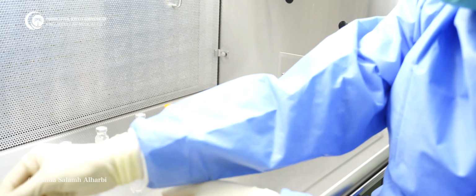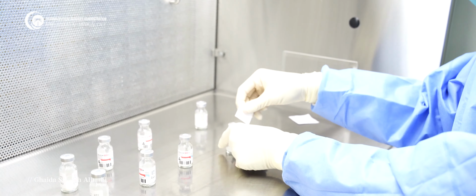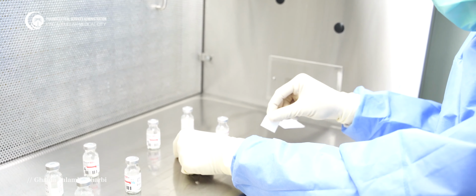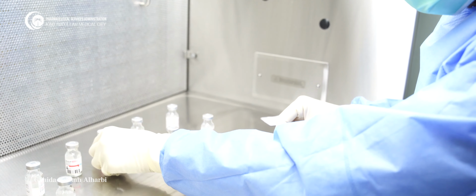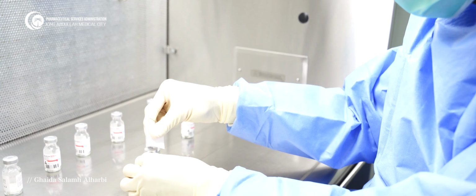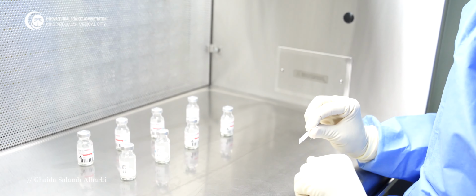We'll disinfect the septum 3 times using alcohol swab and allow to dry. Now we will prepare mini bag stock.